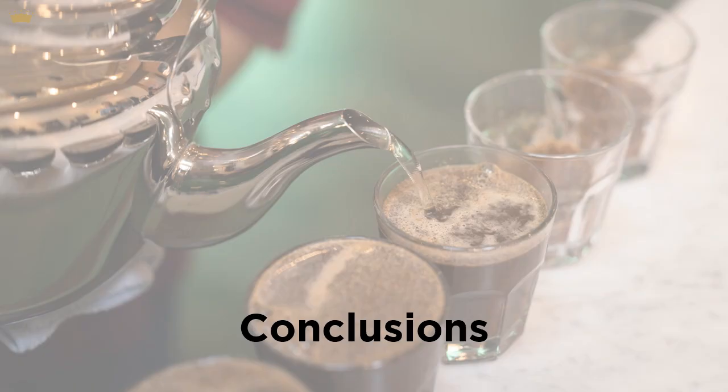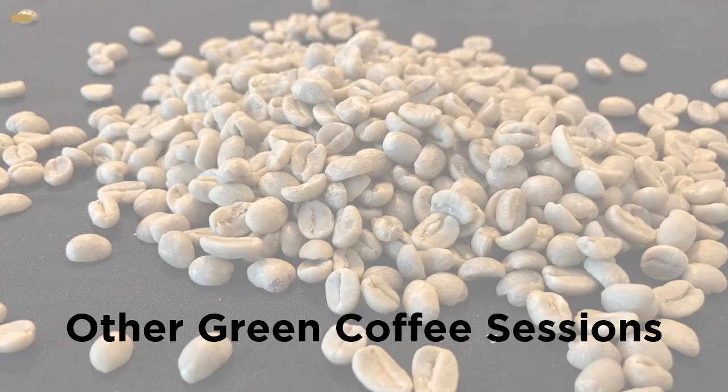Ultimately, even if we are able to solidify these initial results with further research, there's no substitute for tasting your roasts. Knowledge of moisture content and water activity allows roasters to make informed choices, but it's never going to replace your own sensory observation and roasting decisions. That's the conclusion of moisture content and water activity in green coffee.